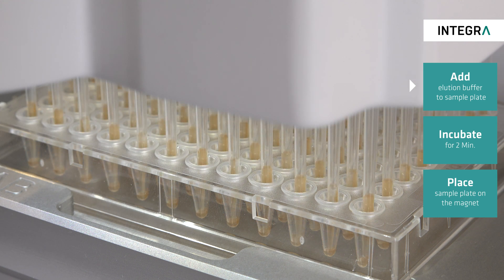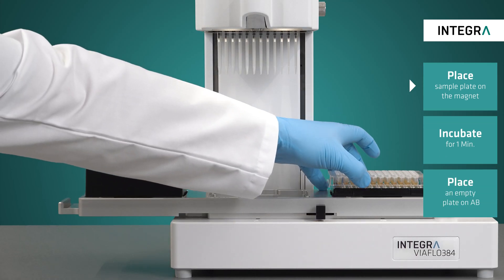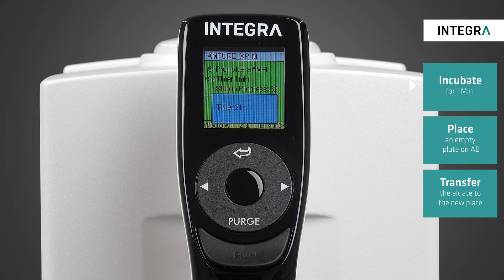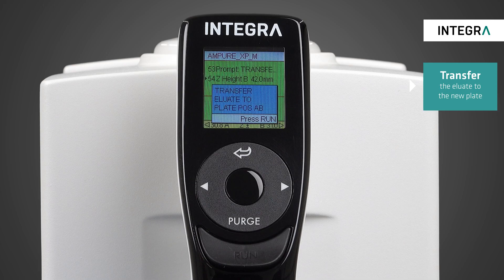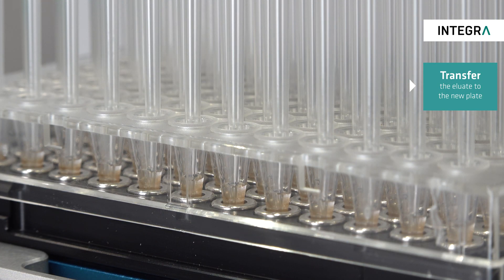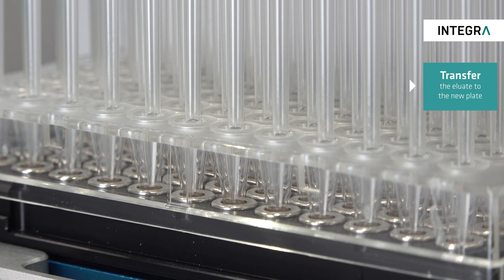Afterwards the plate is allowed to incubate for two minutes in order for the DNA to unbind from the beads. Then the sample plate is placed back on the magnet for one minute so that the beads can separate. As this is happening, an MT 96-well elution plate for the purified DNA sample is placed on position AB and new tips are loaded one last time. With these new tips, 40µL of the eluate is collected from the sample plate with the correct height pre-programmed to eliminate bead carryover.